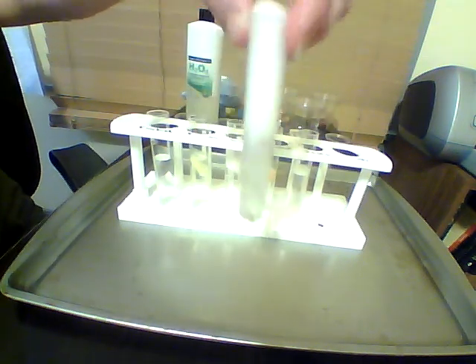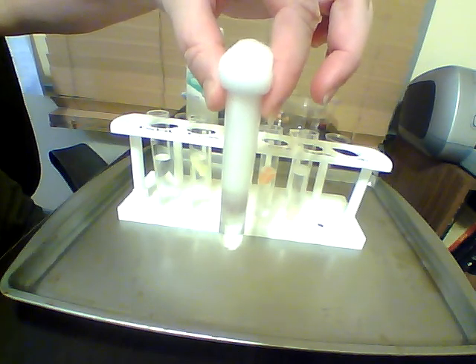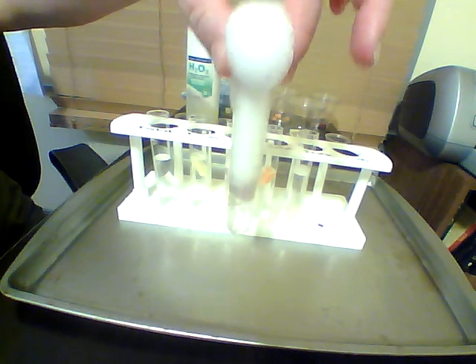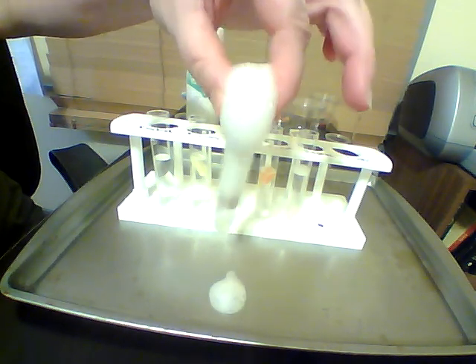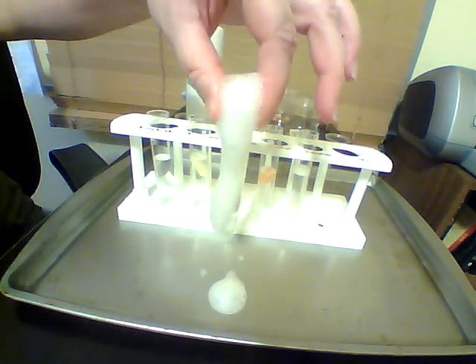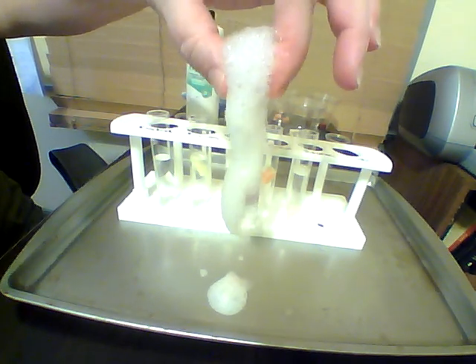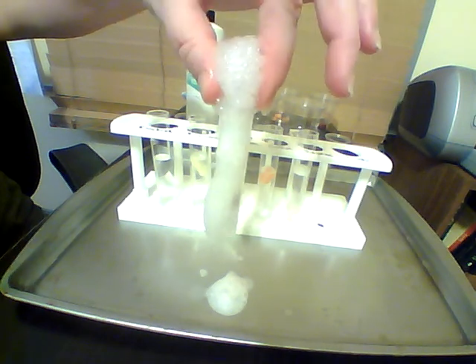And this is our liver, which didn't actually get all the way down into the hydrogen peroxide. So you can see as I shake it and mix this up that it has quite a dramatic reaction, right? The bubbles are all over the place. They won't stay inside the tube, and it actually feels warm to the touch.